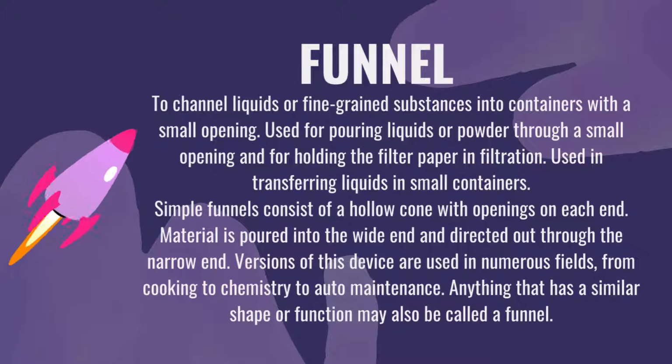Dear fellows, do you know what a simple funnel is? Simple funnels consist of a hollow cone with openings on each end. Material is poured into the wide end and directed out through the narrow end. Versions of this device are used in numerous fields, from cooking to chemistry to auto maintenance. Anything that has a similar shape or function may also be called a funnel.